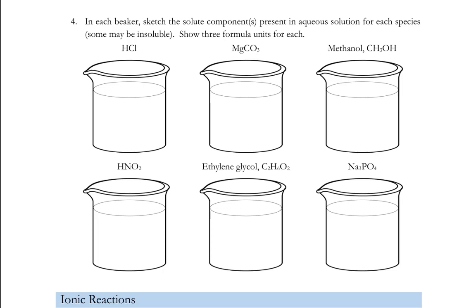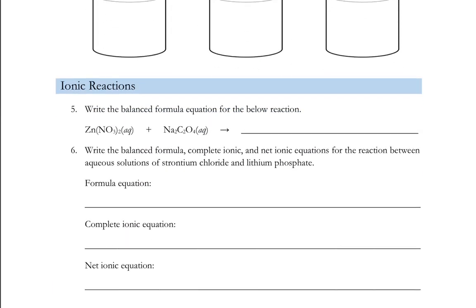We also have 2 molecules, methanol and ethylene glycol. Methanol is soluble in water just as ethanol is, but it's a molecule. Ethylene glycol is the material in antifreeze, and that also makes for a solution. We don't have 2 layers, so that means ethylene glycol is soluble in water, but it's also a molecule. Keep that in mind.